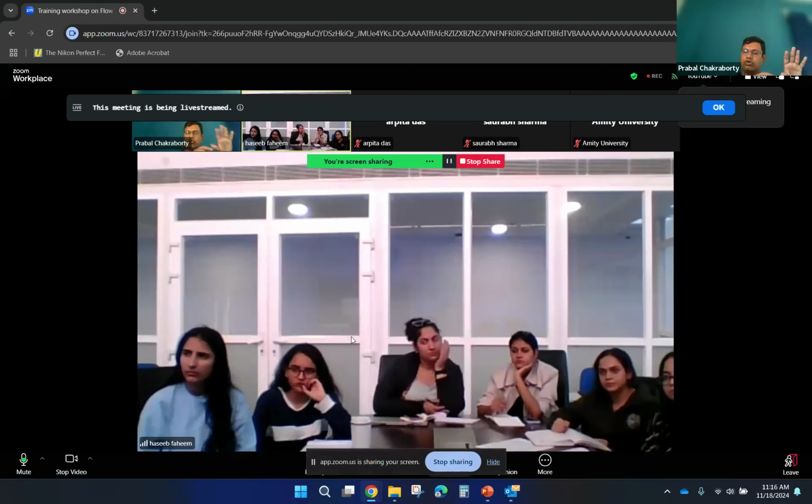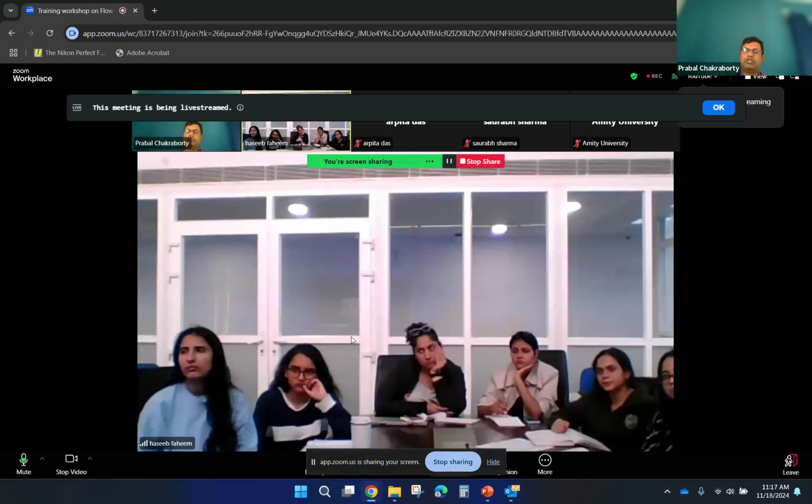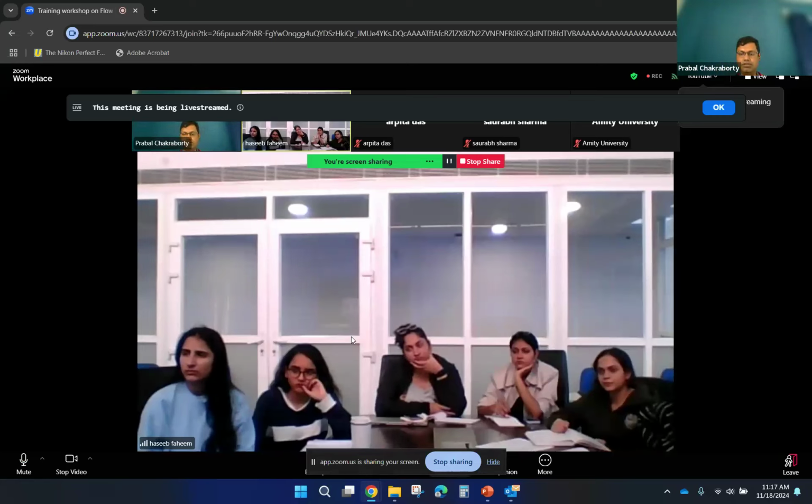Probably in the control sample you can see elongated normal mitochondria, whereas in the treated sample, you can see mitochondria become very small globules, round type of structures. So that means mitochondria got fragmented. From the image observation, you can conclude, okay, my mitochondria has some damage, or this reagent is causing some damage. So that kind of inference or conclusion you can draw.